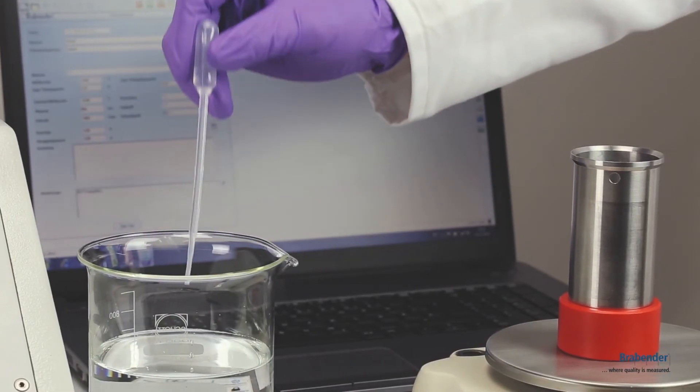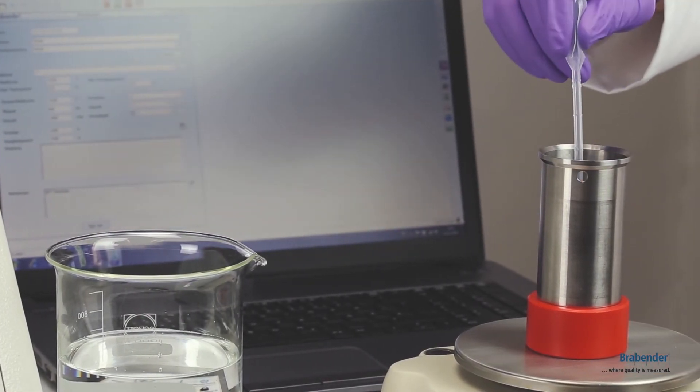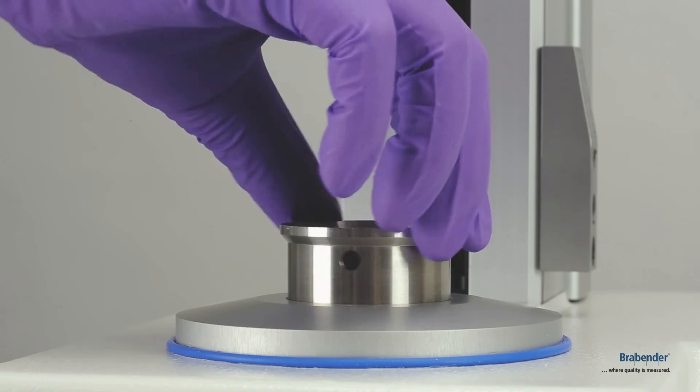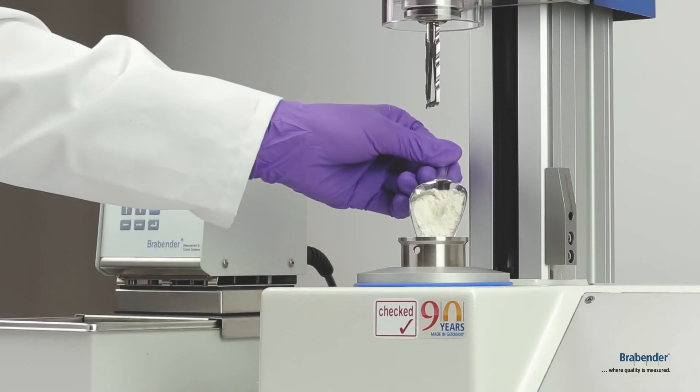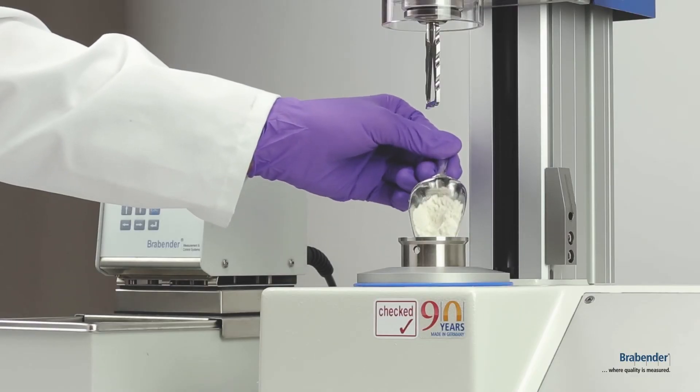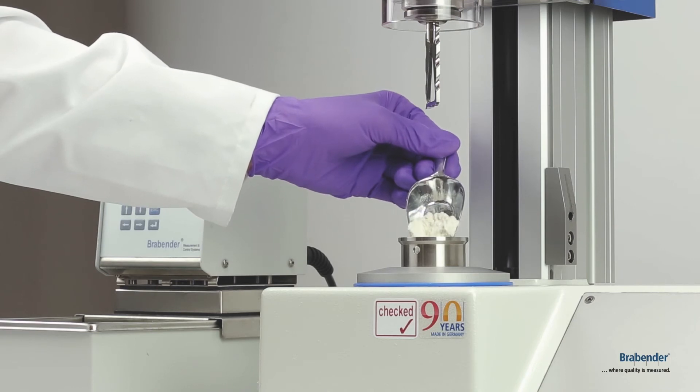Fasten the paddle. Weigh 10 grams of distilled water in the sample pot. Fit the sample cup into the device.